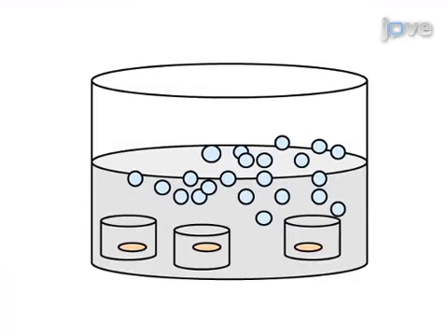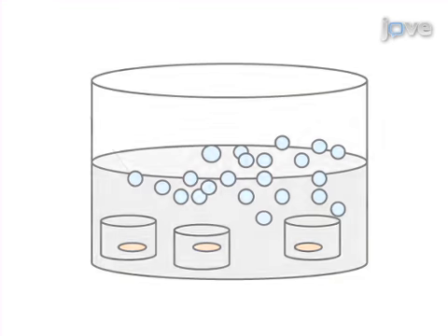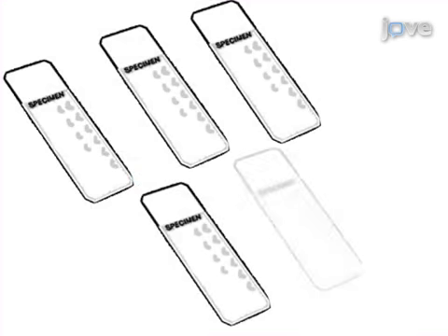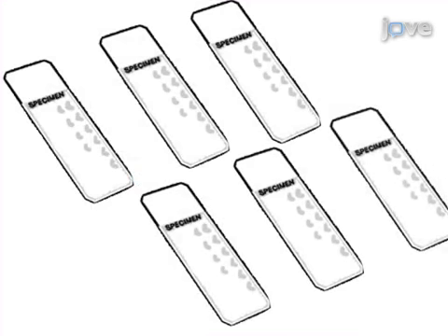Next, the sample is incubated in oxygenated artificial CSF for 20 minutes to allow for dye transfer. Finally, a histological preparation and sectioning of the tissue allows for microscopic visualization of the acoustic ganglion central projections.